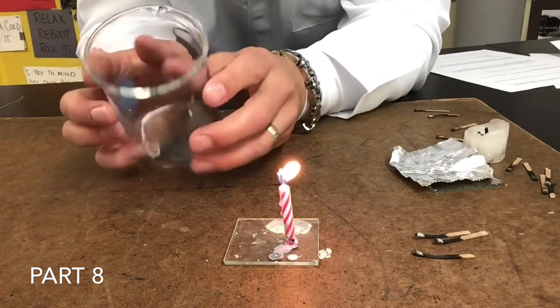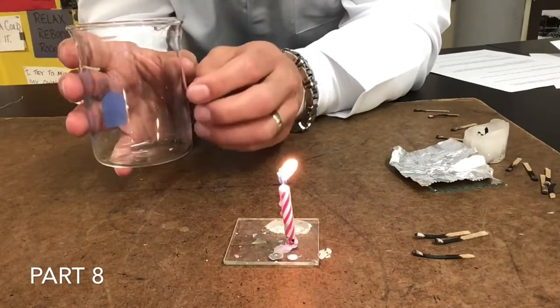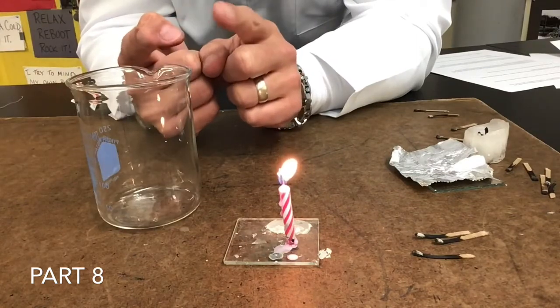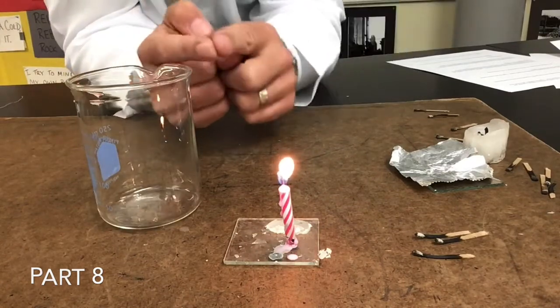So that was part 8 of the experiment. Write down your observations, make sure you read what it's asking. When you write observations, make sure you're clear and concise so that they mean the same thing for everyone.